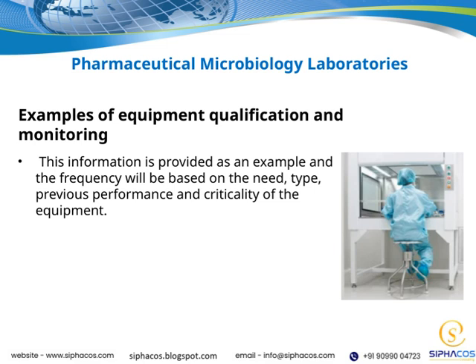This helps us catch potential issues early and keeps everything within the required specifications. So, the key takeaway here is that our approach to qualification and monitoring should be tailored to each piece of equipment based on these various factors to maintain the integrity of our processes and products.